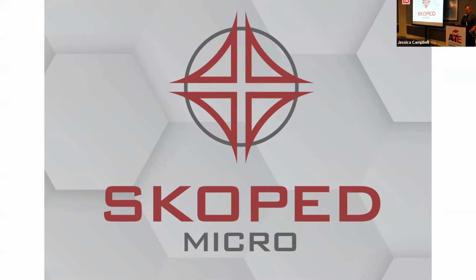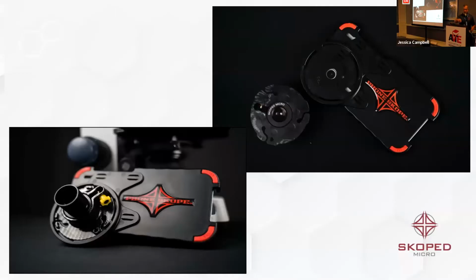So what are we actually going to look at? So here's kind of our hard products. It starts with a phone case. We have phone cases we make for literally any phone, and it starts with a microscope adapter. Those go together to look something like that. We do make a universal adapter that works well.